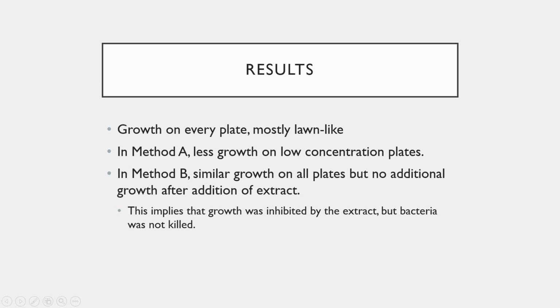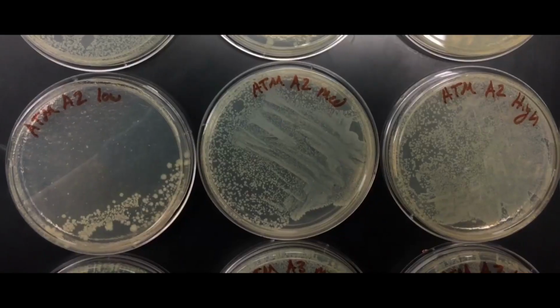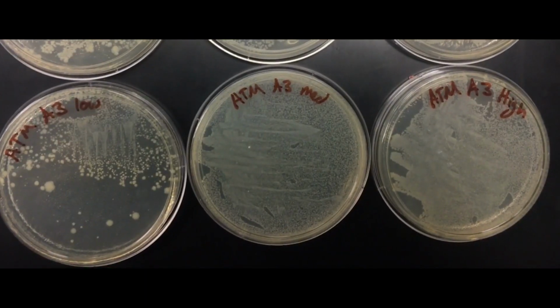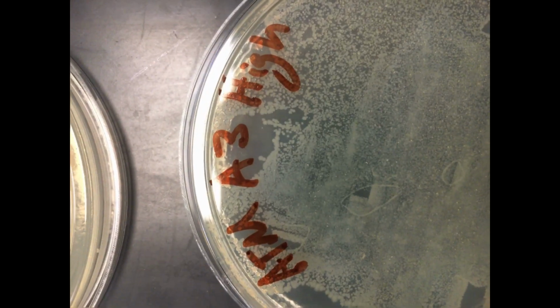As for results, I found growth on every plate, mostly lawn-like growth of lots of bacteria, not individual colonies. In method A, there was less growth on low concentration plates, while in method B, there was similar growth on all plates, but no additional growth after the addition of extract. This result implies that growth was inhibited by the extract, but bacteria itself was not essentially killed.